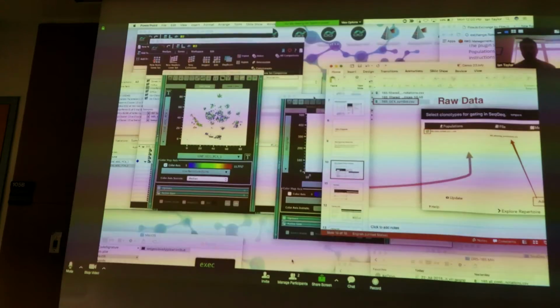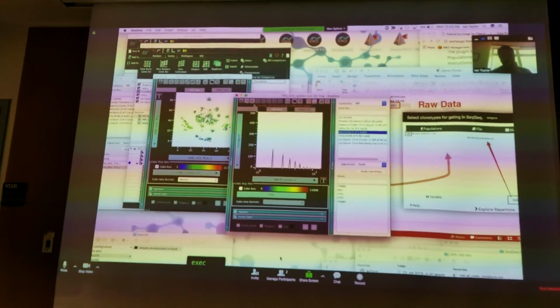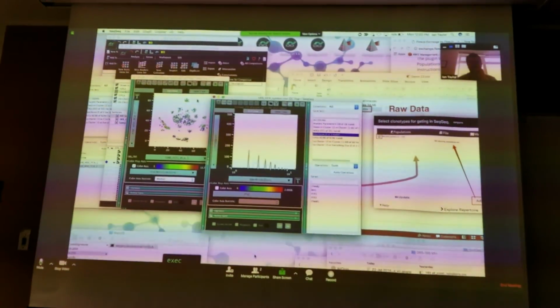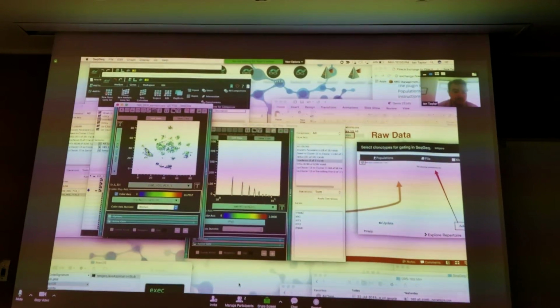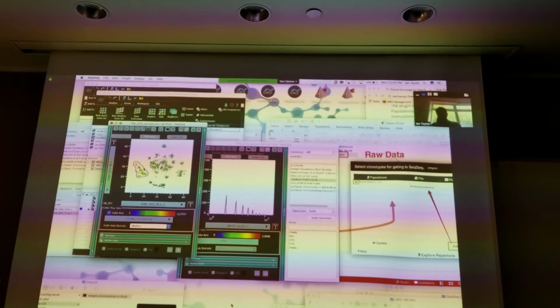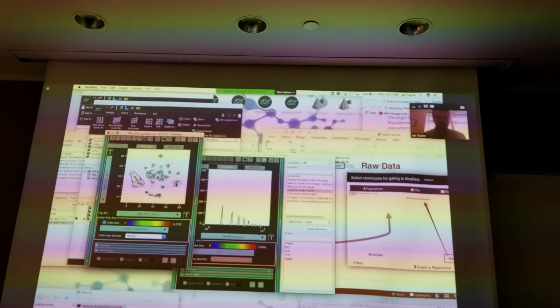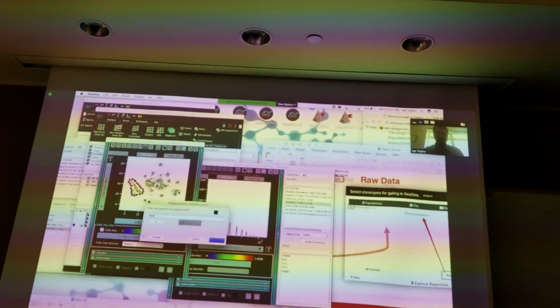Or you could pick a subset too. You can, because you can just circle all of the areas that you have decided first, down that have VDJ region expression. Right. So isolate them in a hierarchical gating methodology and then choose one or the other. You can isolate this in any way, drawing like a density gate on this T-SNE plot. Can you draw it on the other side though? Because those are the macrophages over there, probably.